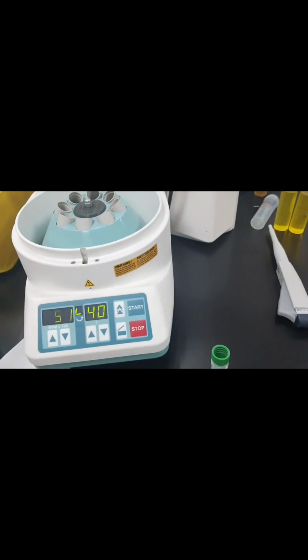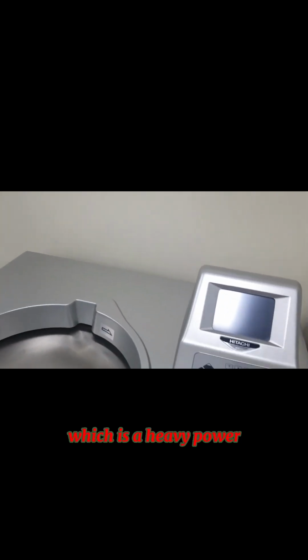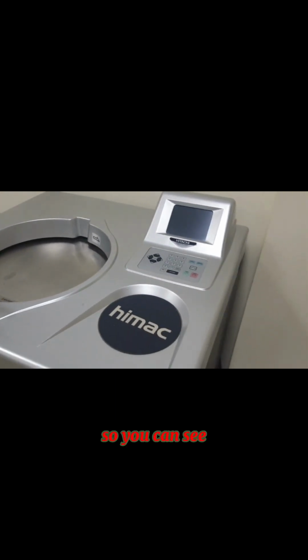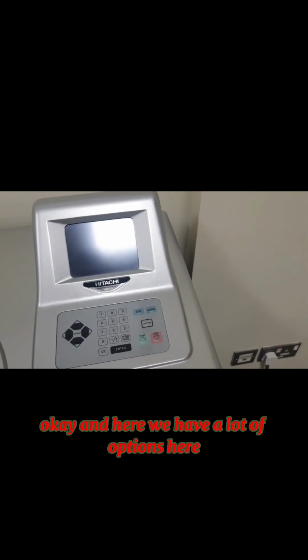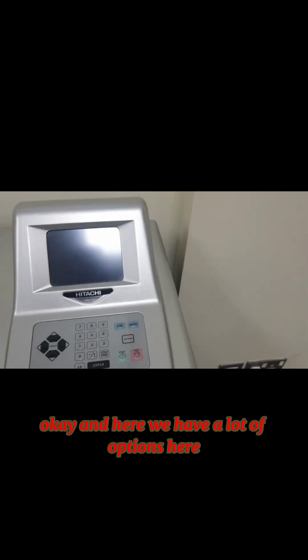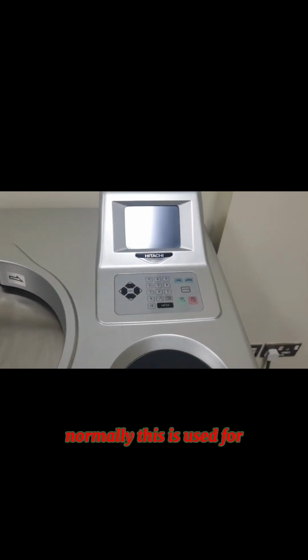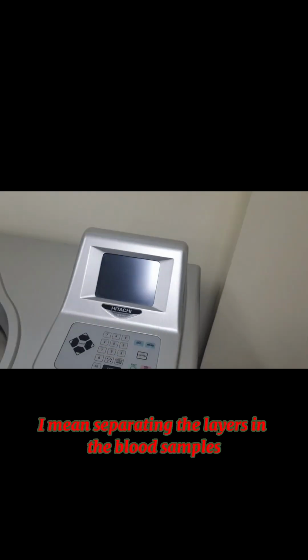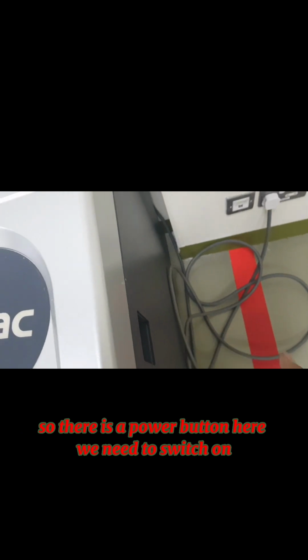Now this is another kind of centrifuge which is a heavy power one. You can see the name is Hitachi, and here we have a lot of options. This is a preparative ultracentrifuge. Normally this is used for separating the layers in blood samples. There is a power button here we need to switch on.